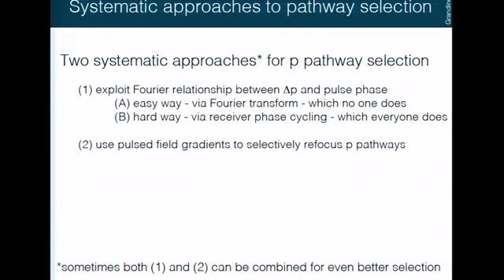Now, when you're using phase cycling or using pulse phase, there's an easy way to do it, which I'm going to tell you about, and no one does it this way. But it's the easiest way to conceptually understand what's going on. So I want you to understand it first, and then we'll work on the hard way, which is through receiver phase cycling, which is what everyone does, and I'm not going to talk about. I've been giving this talk for over 20 years, and I left in my notes all my extra notes on how to do this with receiver phase cycling. But I hope maybe by the end of this talk, you won't want to use receiver phase cycling anymore anyways, because you don't have to.